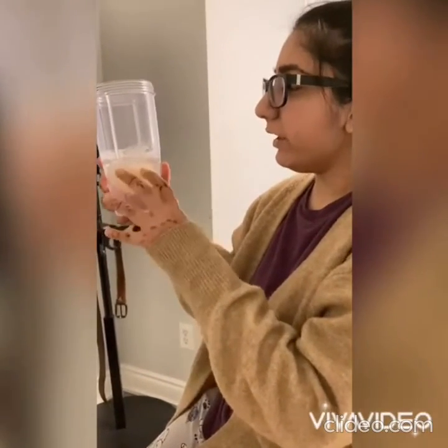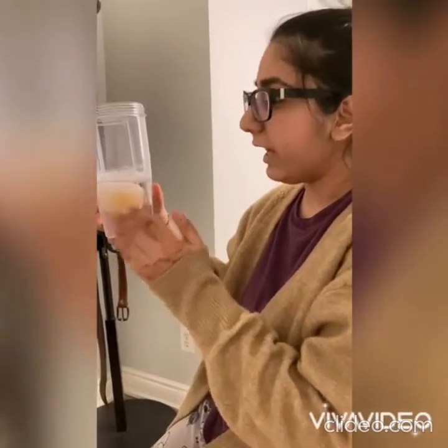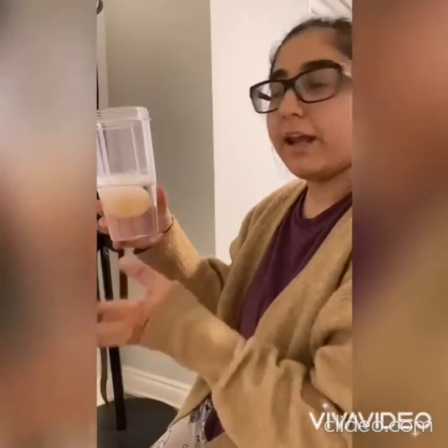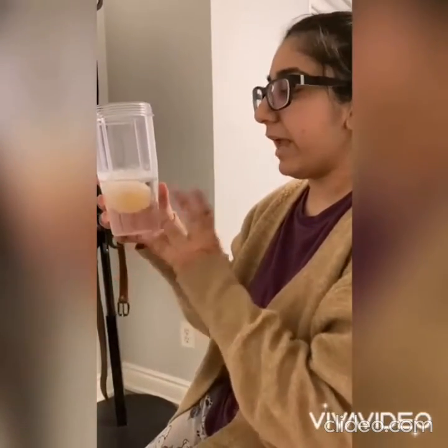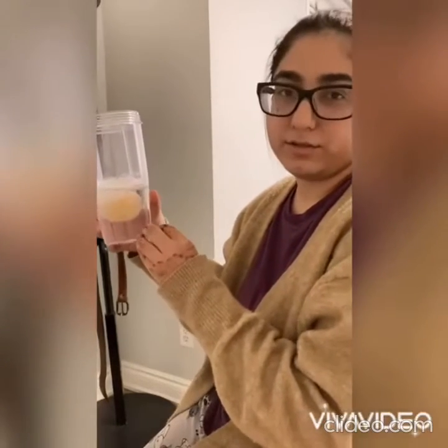Now I will be rinsing out this vinegar and I will add some fresh vinegar into the egg and let it sit for 24 hours. Then I will make some more observations and then essentially analyze what is causing these physical changes.